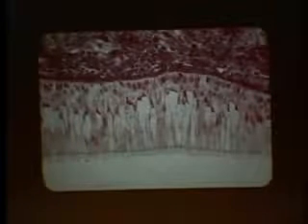In the next one. Now, what kind of epithelium do we have here? It's pseudostratified columnar. What are these? Cilia, ciliated with goblet cells. Goblet cells are filled with mucus, so the nucleus is pushed way to the bottom. So as this is the most complex epithelium, and we see it... Whoops, am I still on? I thought I lost it. All right. Our respiratory epithelium that we find in the nasal cavity and in the larynx and so forth.